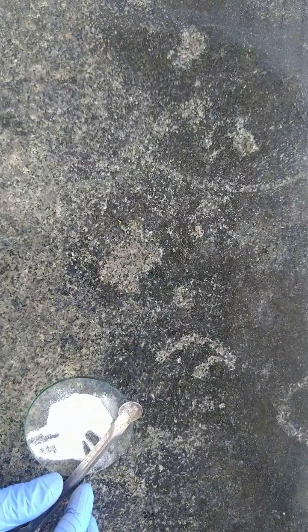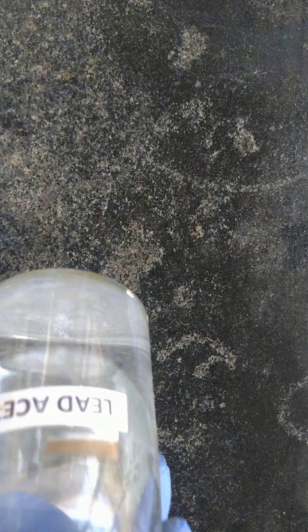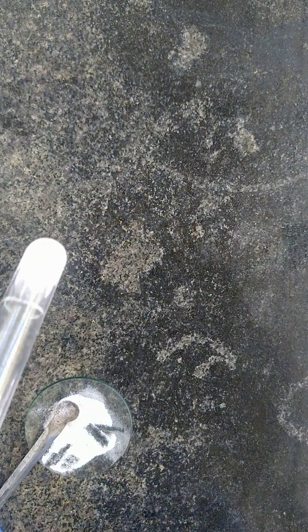Because we are getting group 3 present, we will go for the confirmatory test for sulfate. So again I am taking a test tube. To this I am adding the salt, and to this we are supposed to add lead acetate. So the confirmatory test for sulfate includes salt plus lead acetate. So look at the observation which we are getting now. You can see that we are getting white precipitate, which will confirm that sulfate is present in the given salt.